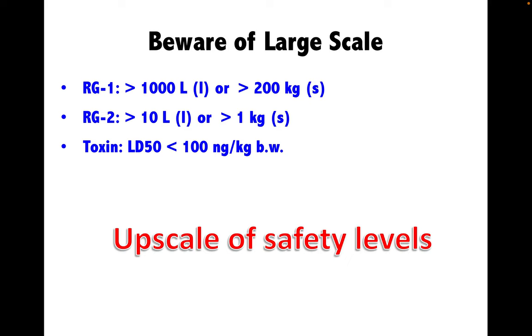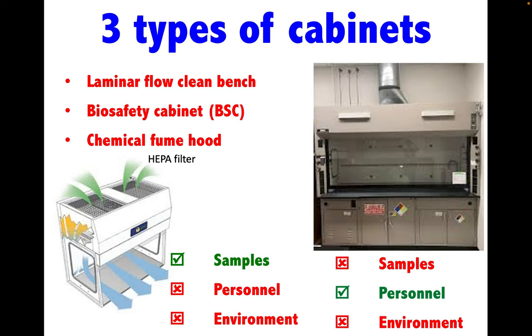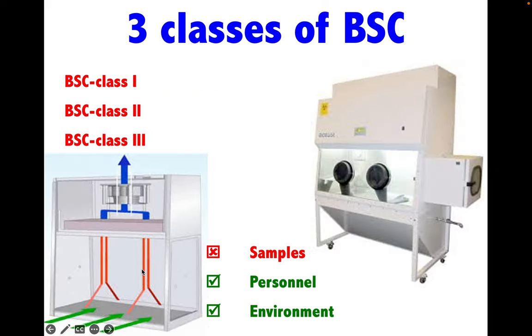To work safely under safety containment, the safety cabinet has been designed and classified into three main types: the laminar flow clean bench, the biosafety cabinet or BSC, and the chemical fume hood. The chemical fume hood works to protect the person from volatile chemicals, but is designed to protect neither the environment nor the sample. In the case of the laminar flow clean bench, although sterile air passes through a HEPA filter down to the working area, the person and the environment are not protected — only the sample is protected.